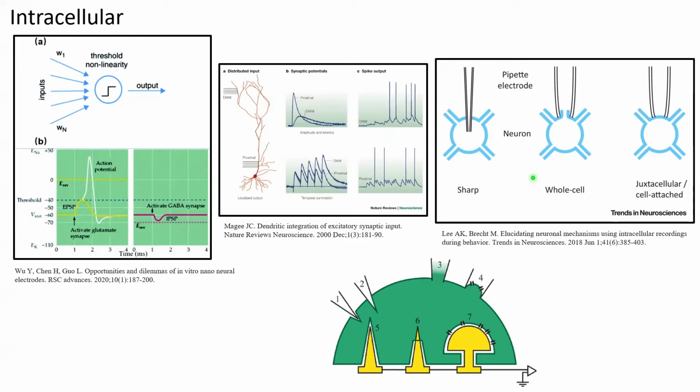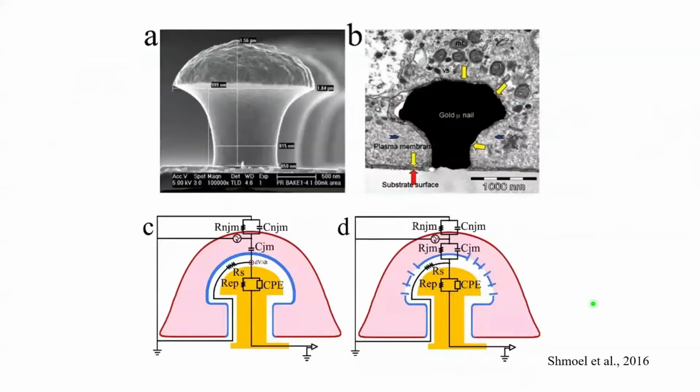Combining the advantages of both intracellular and extracellular recordings, in other words, a method that enables recording of the entire electrophysiological repertoire of many single neurons in parallel for weeks, months, and years in a behaving animal into one method, will be the dream neuroprobe and will substantially enhance brain research and understanding. Despite the limitations that I described now, most of the attempts by the neuroengineering and user community focus on how to increase the number and density of electrodes that a platform can carry, and not how to improve the recording quality and yield.